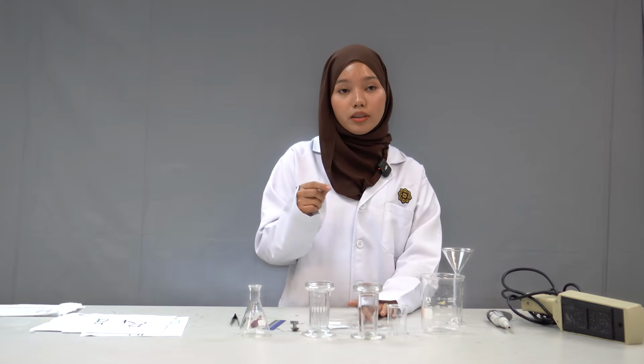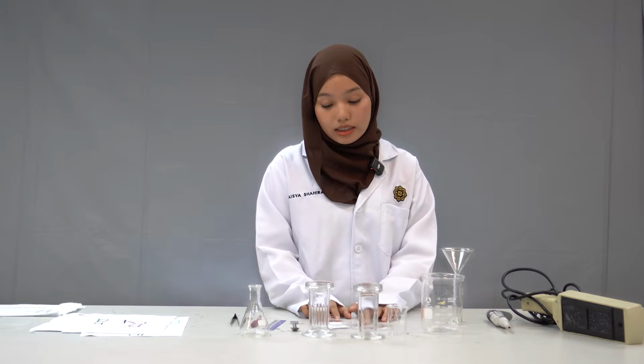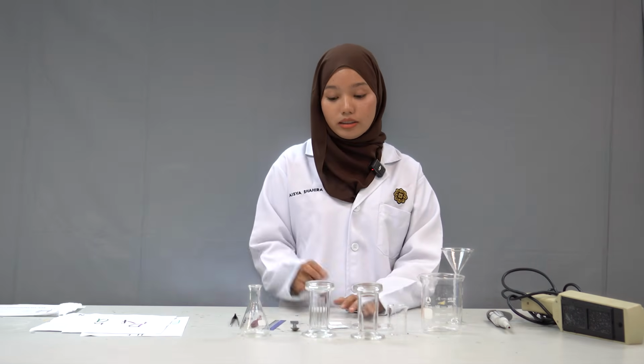So it may interfere with the movement of the sample spot or create extra spots on the TLC plate, which can lead to an inaccurate result.